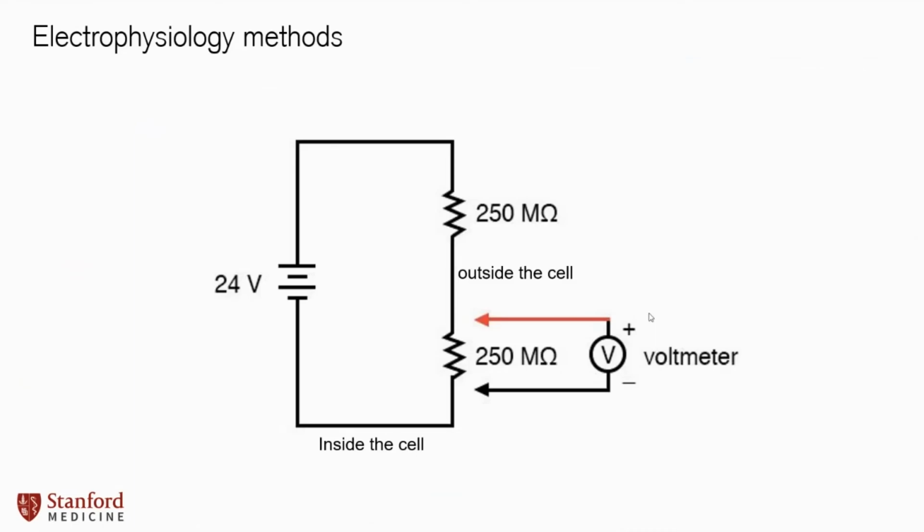Okay, so what about different neural activity readouts? What are people working with in the field, and how do they compare to each other? I'll just start with the very typical electrophysiological methods and why I wouldn't recommend them. The principle behind electrophysiology methods is just that the cell acts as a resistor, and there is a voltage across the membrane. So you can measure that voltage difference within an individual cell, or you can try to measure those little voltage differences across broad fields of many, many cells, where the aggregate field potentials add up and summate.